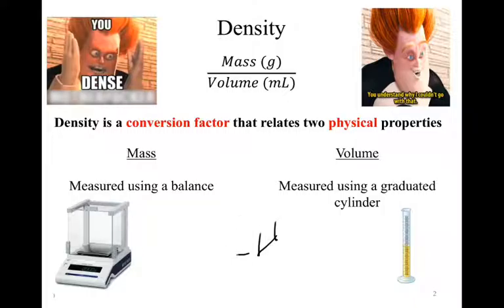Archimedes said that when we measure our volume, the object, when dropped in, will have to displace an equal volume. The volume of that displacement must equal the volume of the object. And I can indirectly measure the volume of my object without having to do any really fancy calculations. I do have to do subtraction, and I can get the volume. Pretty cool.